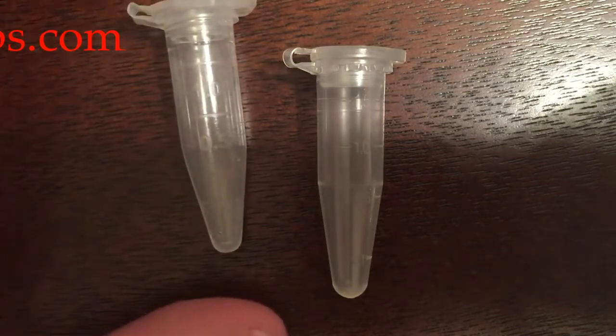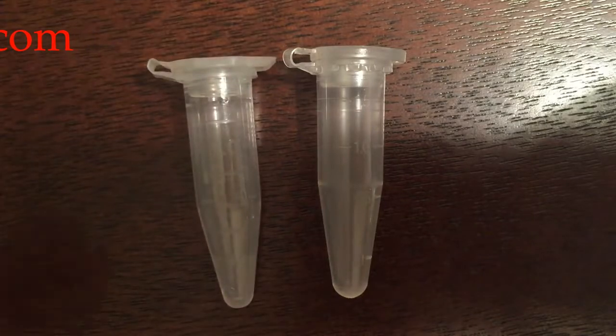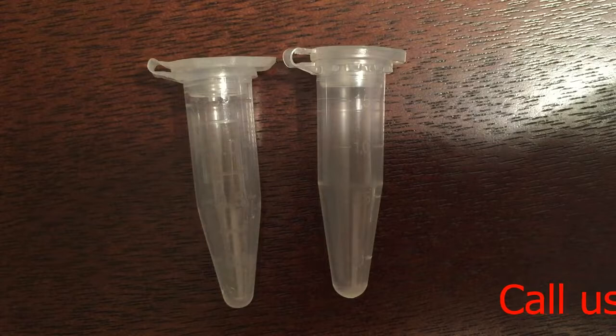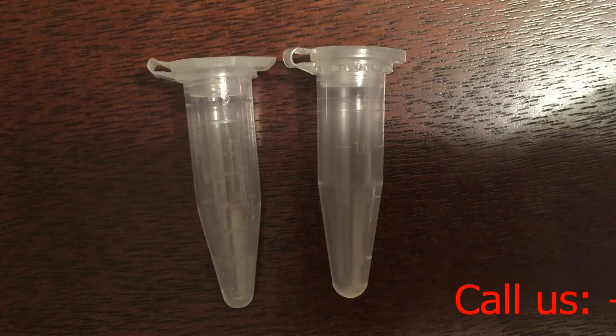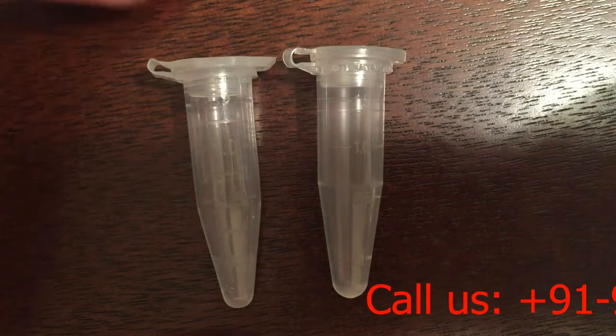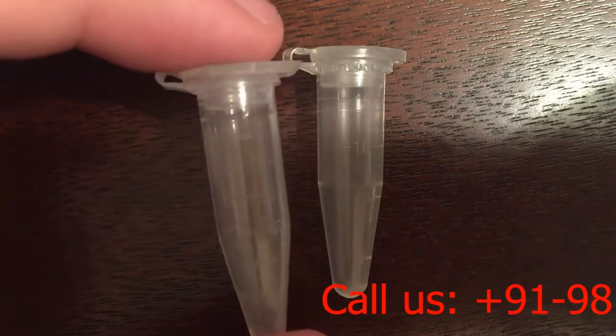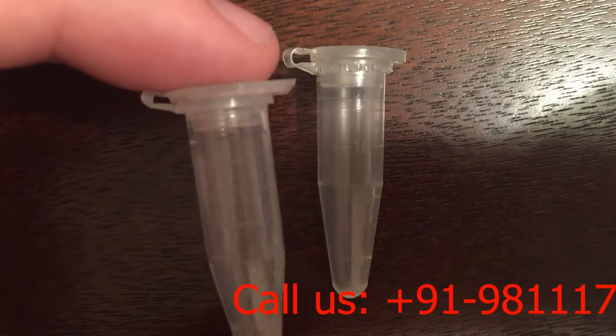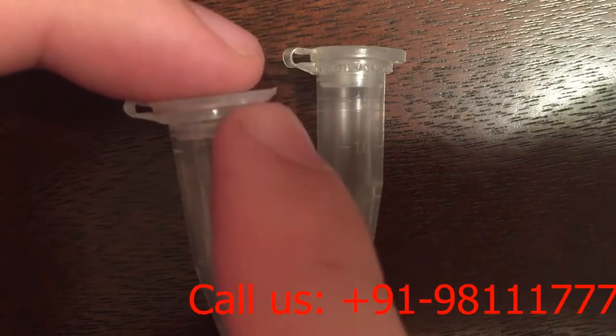Despite the similarity in profile and appearance, there are some advantages to the Brandtek 1.7 milliliter tube. It provides some extra room if you have a liquid that is going to be at or approaching 1.5 milliliters. If your sample is near that volume and you place it in the 1.5 milliliter tube, the meniscus will actually be touching the side of the cap.